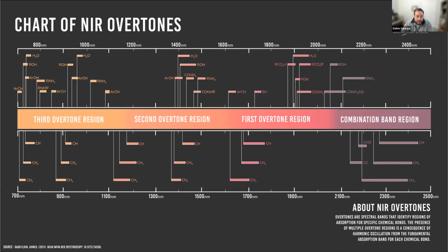We're dominated by water. And for the most part, in practice, it's easier, and it doesn't really change performance that much, to just use the entire wavelength range. So that's either called full band, or it's just called not doing wavelength selection. And so when you do full band wavelength selection or no wavelength selection, you're still getting all the information you need, but now you're relying on other parts of your model building process, and you're relying heavily on your data collection to make sure that you're not getting all these confounding variables or unimportant signals in your data set that are going to cause your model to perform poorly.